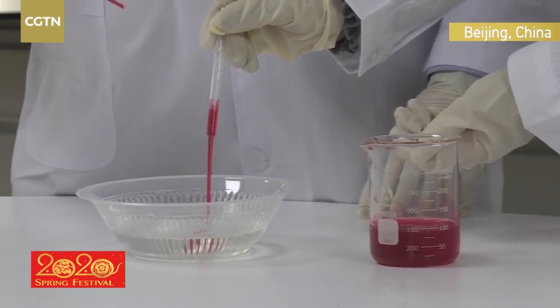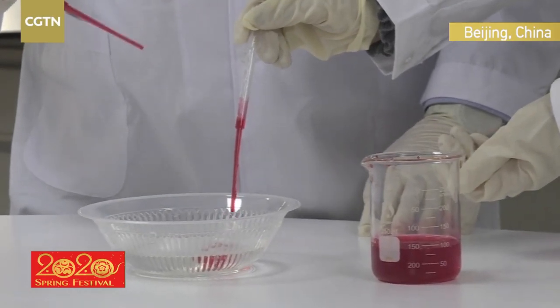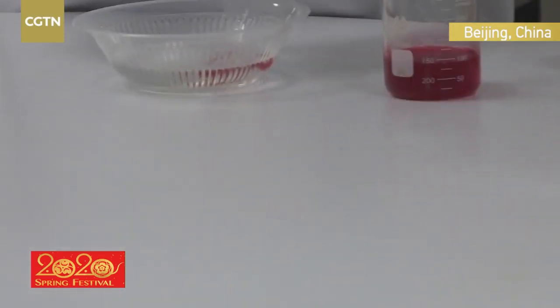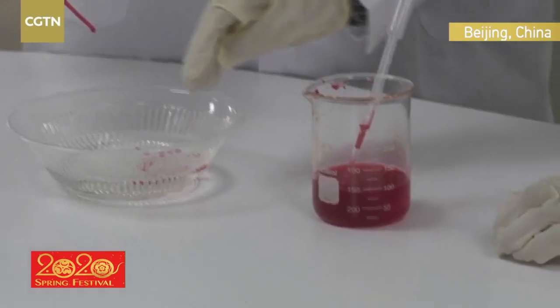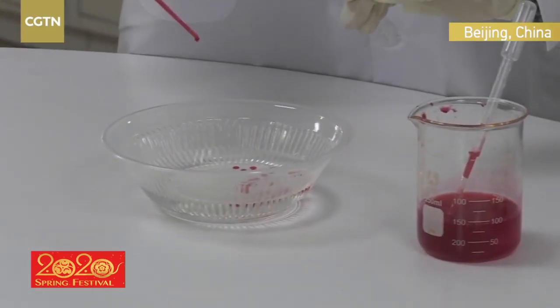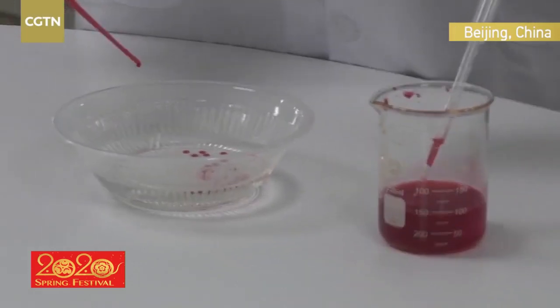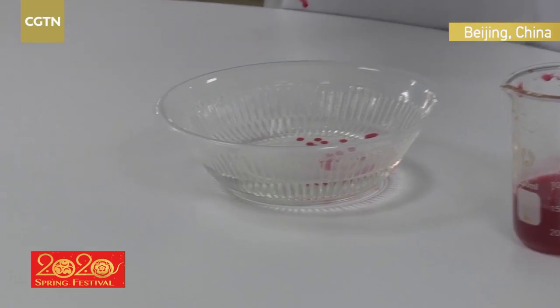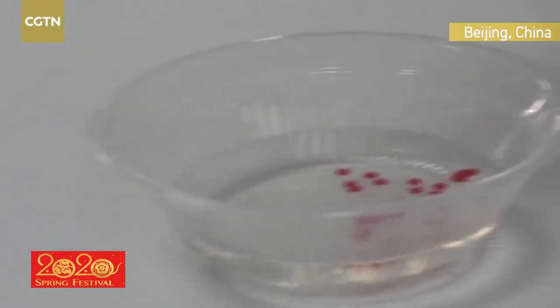So, wow. You can see little gel balls. So the material in here is calcium chloride. It's reacting with this material, which is sodium alginate. Is this poisonous? Can I take it out? No, you've eaten it before, when you eat the gel type fruit gels, they often contain alginate. So you were doing one drop at a time. You can see what happens.